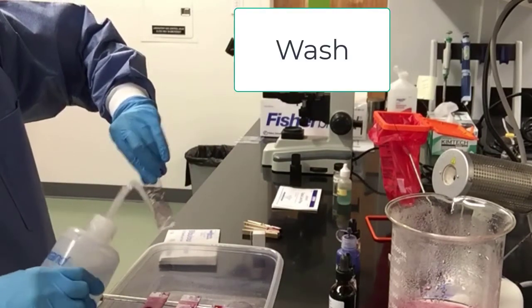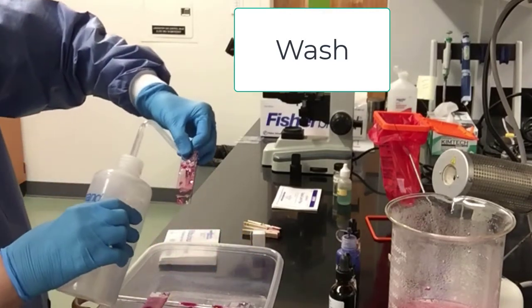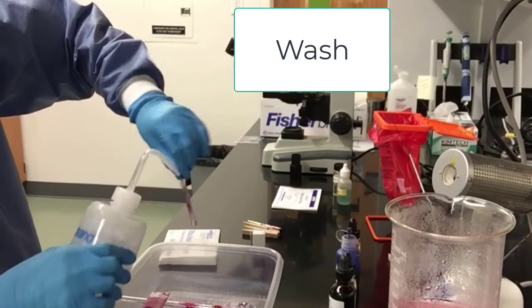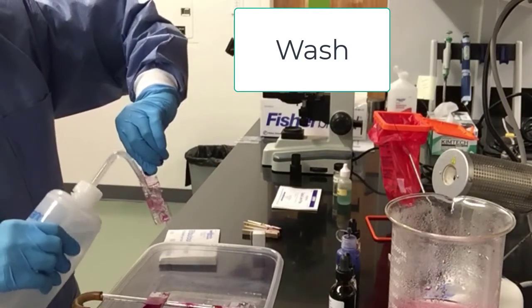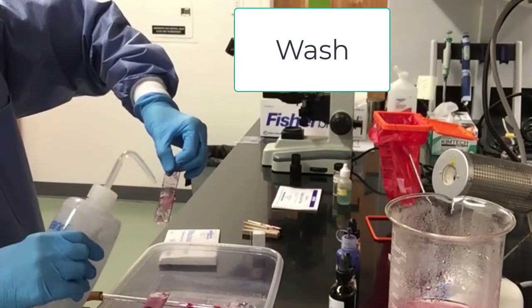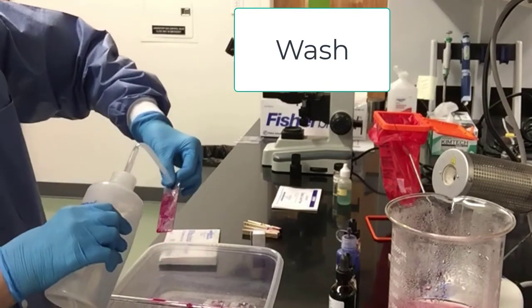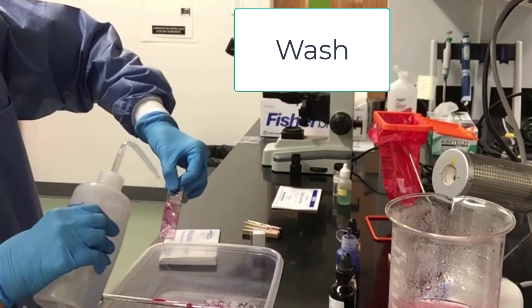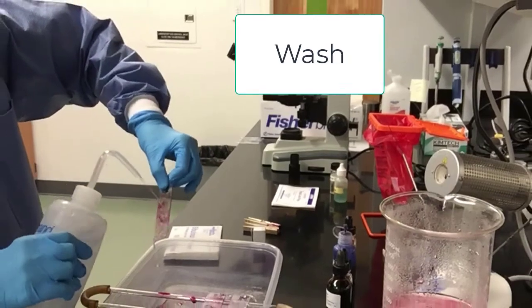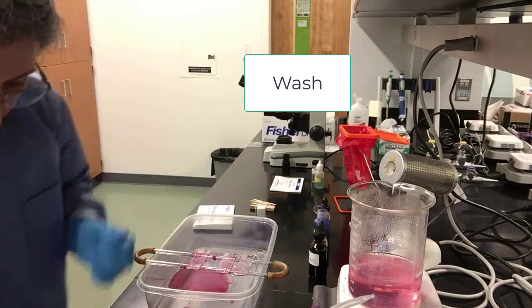A little extra washing. Put it back on the staining rack. Pick up the next one. Be careful not to wash off the label. Wash the slide very well, front and back. Watching the specimen. We don't want to wash off any specimen. And our third slide. Careful washing. All the stain, front and back of our slide, and we lay them on the staining rack.